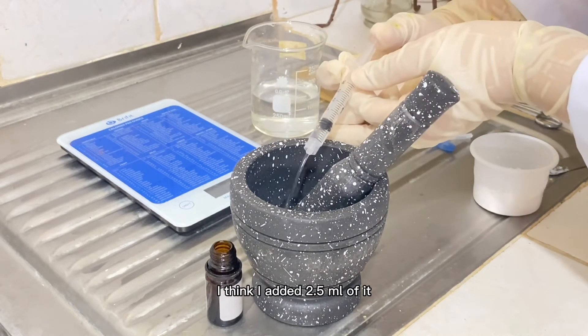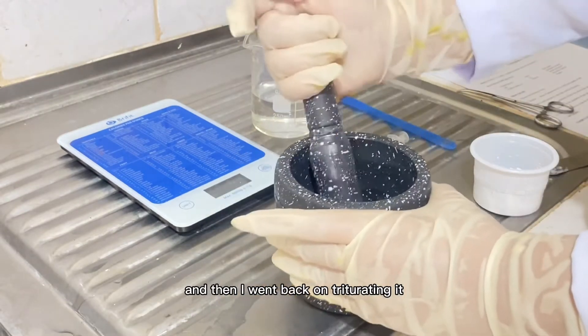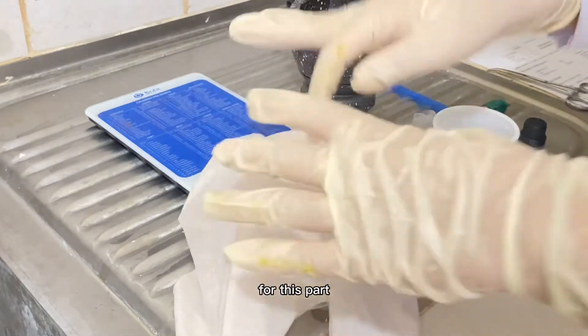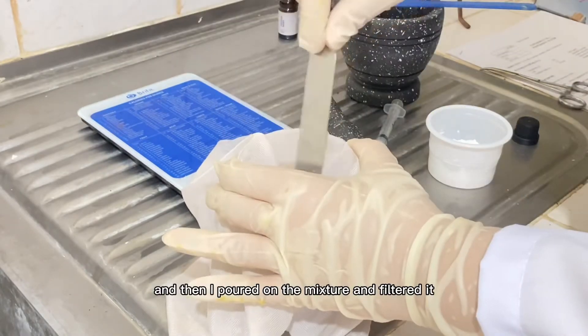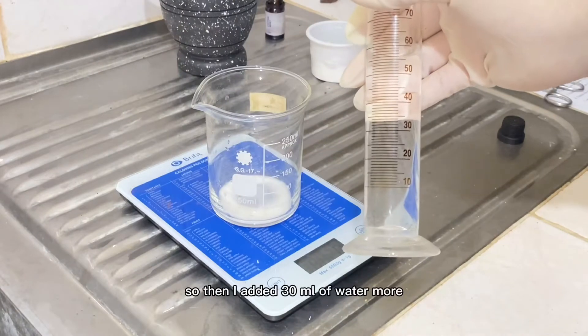I added 2.5 ml of water and then went back to triturating. For the filtration step, I used a fine cloth because I couldn't find any filter paper, and then I poured the mixture through it and filtered it.